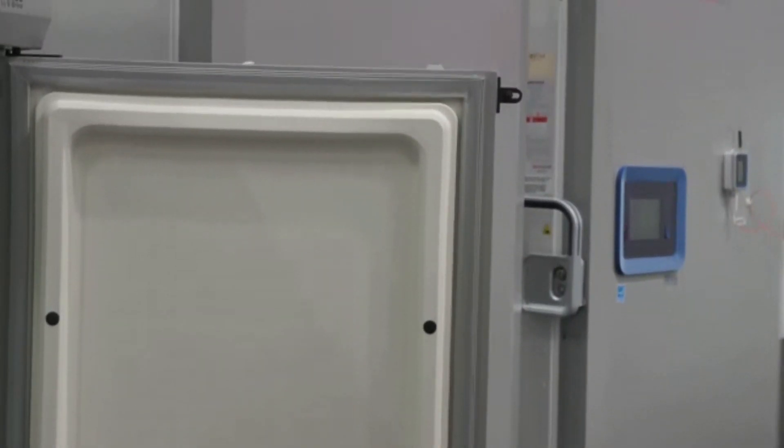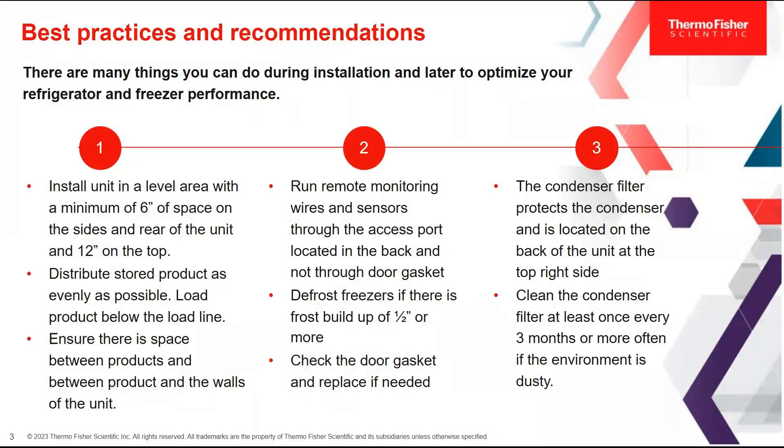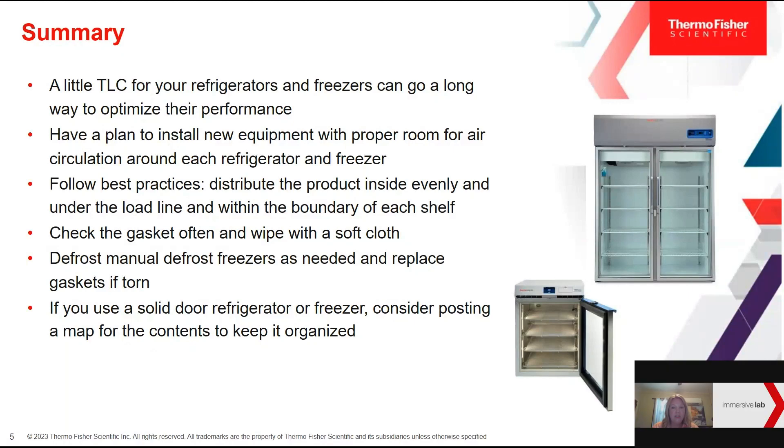Now that you've seen the care and maintenance in the immersive lab, let's summarize these practices. A little TLC for your refrigerators and freezers can go a long way to optimize their performance. It's important to have a plan to install new equipment with proper room for air circulation around each unit, and it's also good to have a designated person in the lab in charge of care and maintenance — making sure units are on a level surface, defrosted regularly, and gaskets are inspected. Distribute the product inside evenly and under the load line and within the boundary of each shelf.